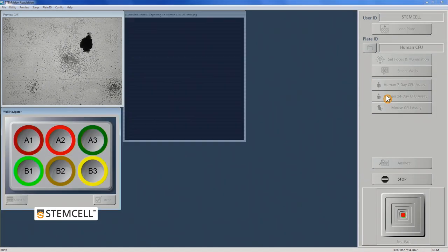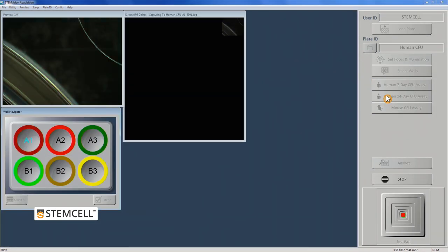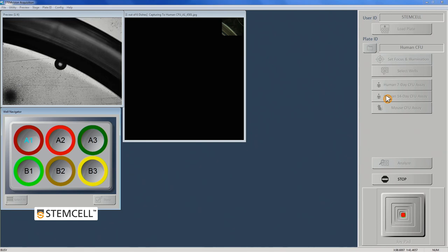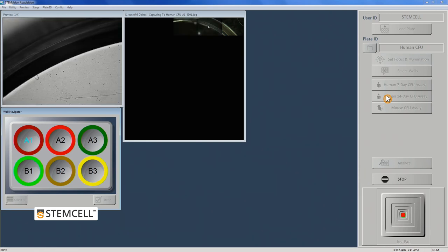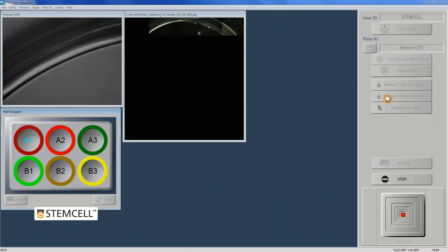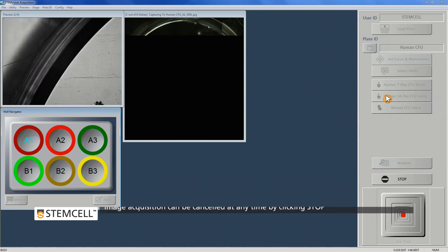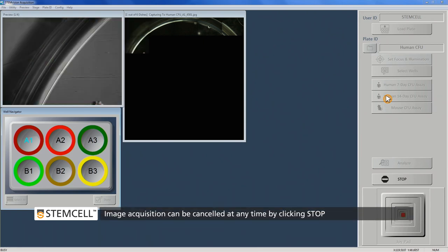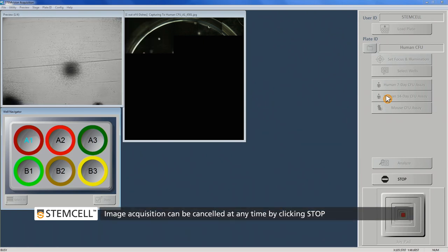If additional plates will be analyzed, simply remove the completed plate, load the next smart dish, and select the wells to be imaged. Illumination and focus will not need to be reset if the same assay type is being imaged.